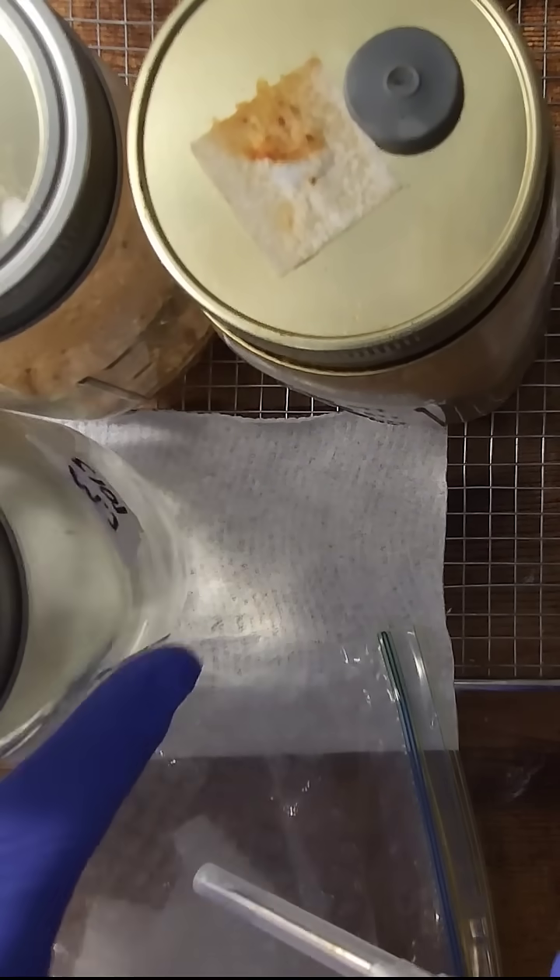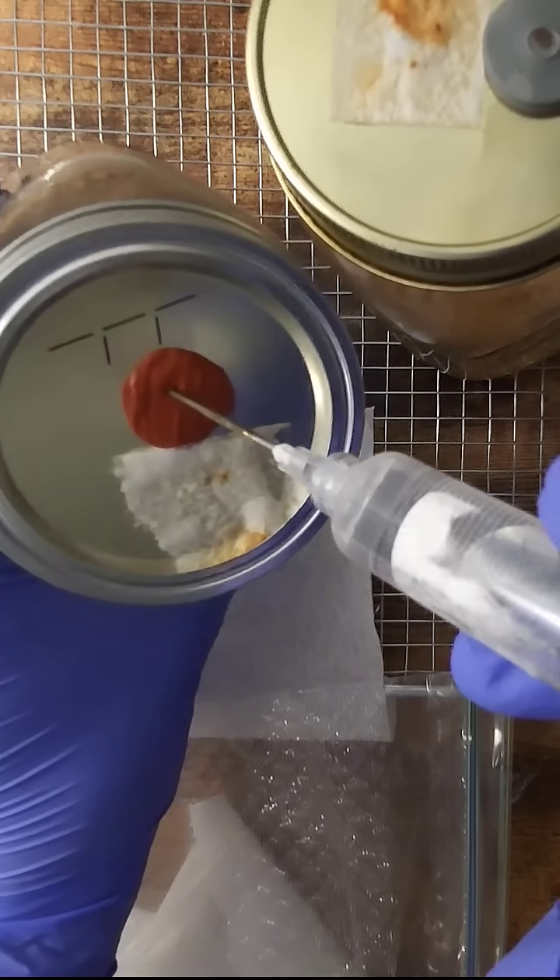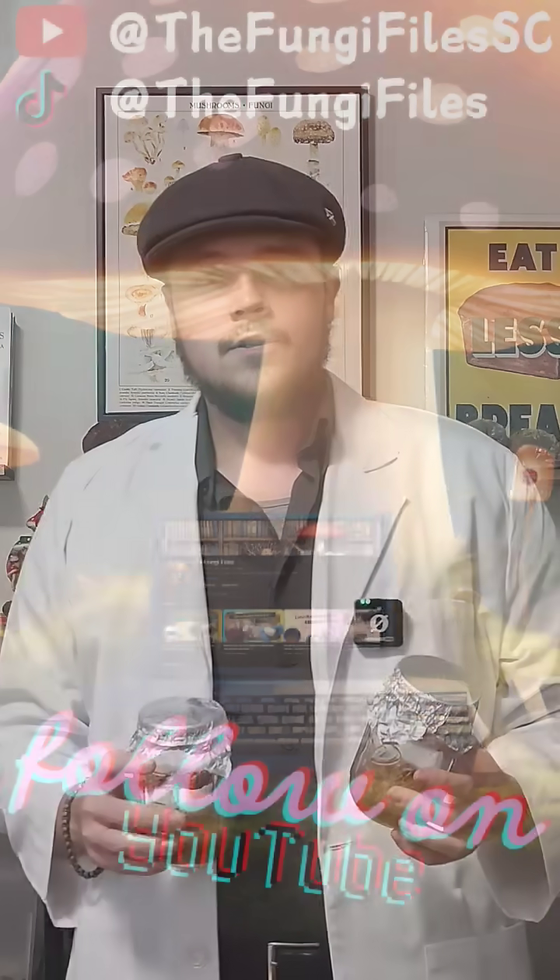We'll start by removing a full 10 cc's of this cordyceps liquid culture to inoculate our second jar. If all goes well, I'll be able to create a tincture packed with all of the medical benefits. So stick around for updates, and let's see where this experiment takes us.